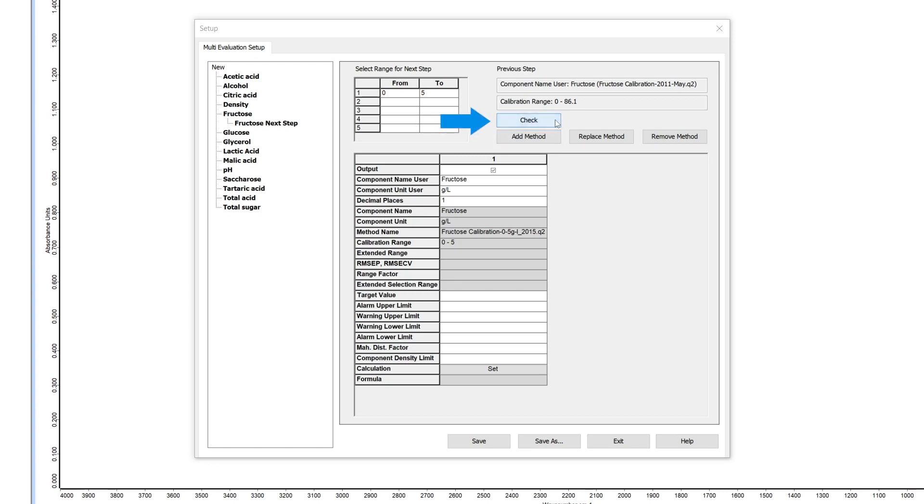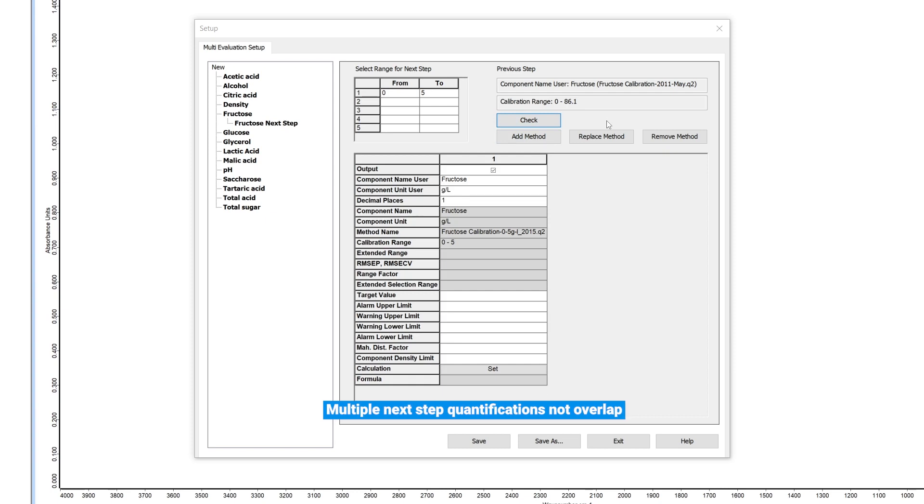Press check to be sure everything works. You can add multiple next step quantifications to one component but only for different ranges. They are not allowed to overlap each other.